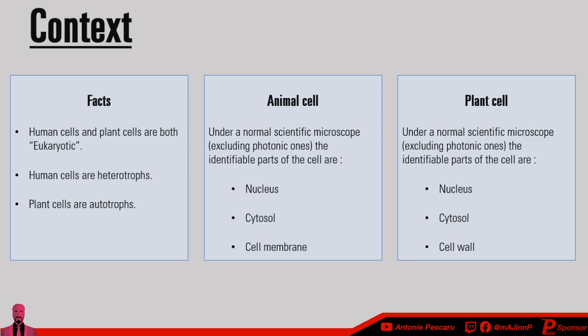Anyways, back to the cell membrane. So the cell membrane is what keeps everything inside, and that is made out of a phospholipid bilayer. I'll get back more into that once we take a look at our human cell, an actual human cell that we're going to take a look at under the microscope. But moving on to the plant cell.